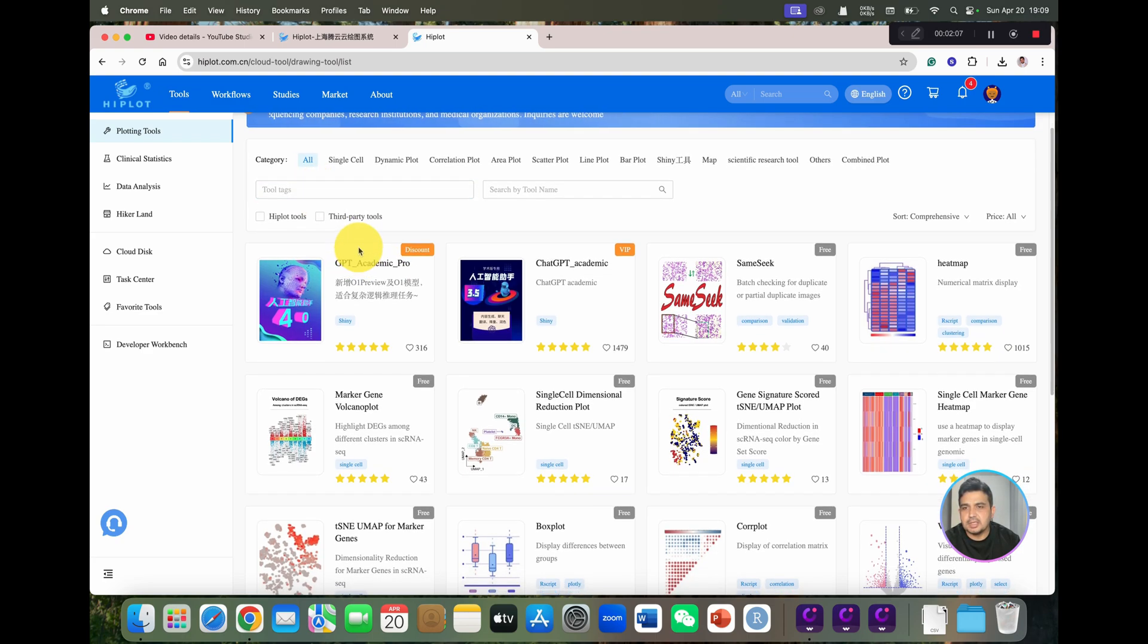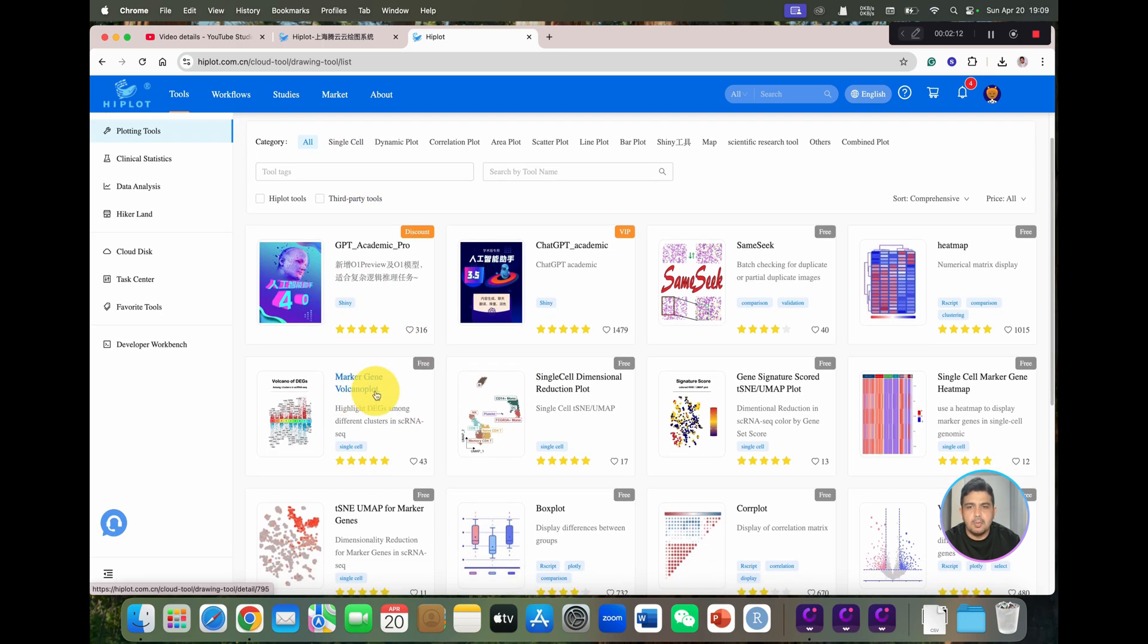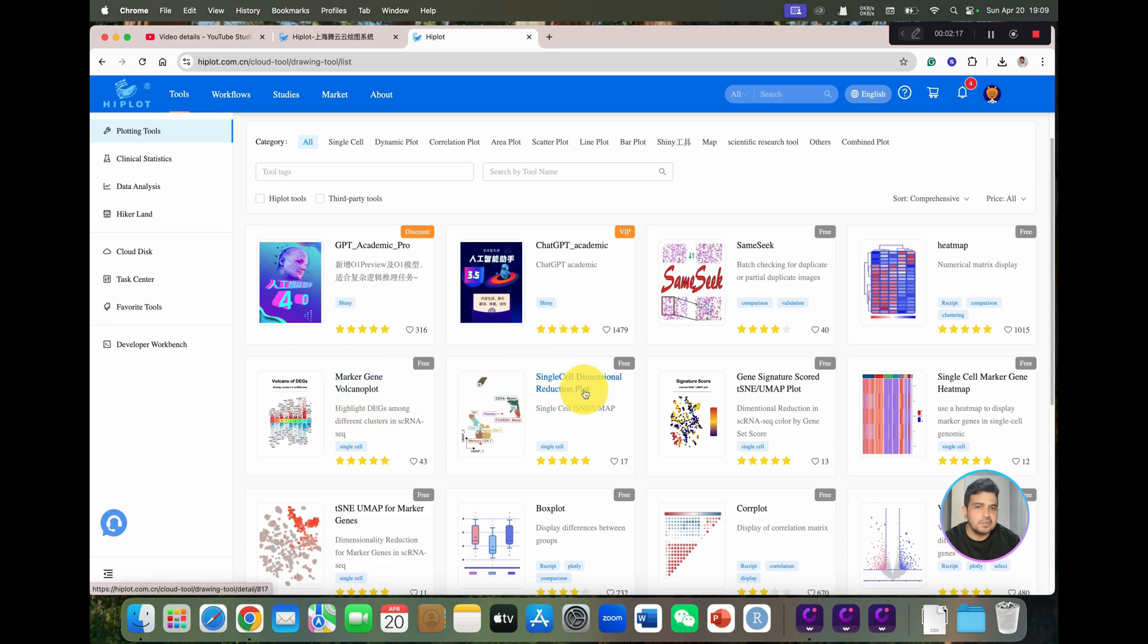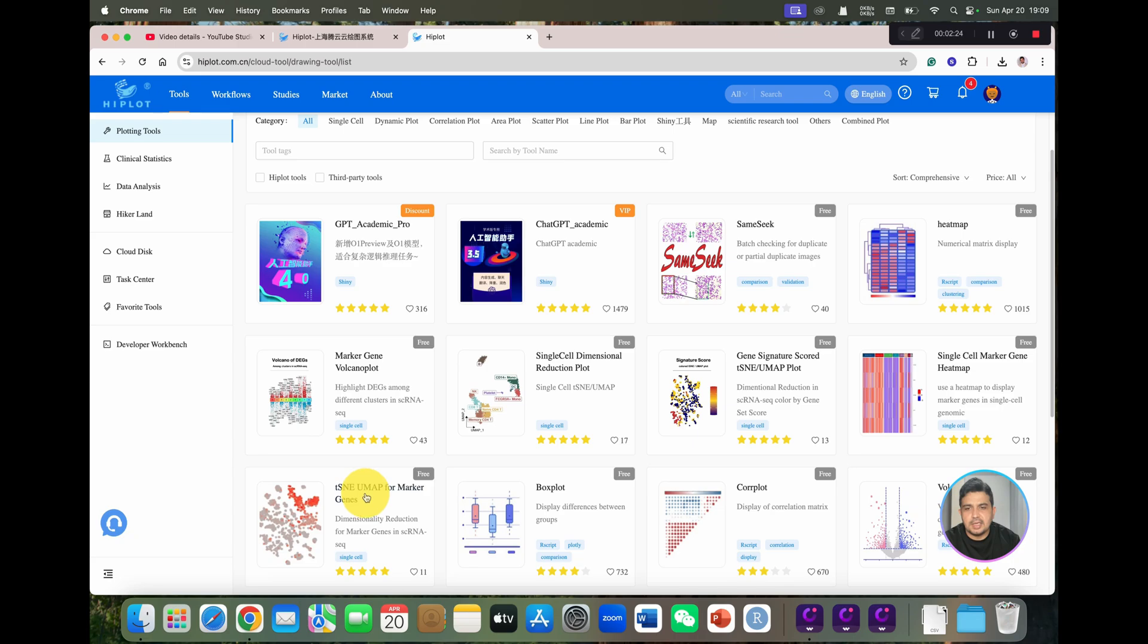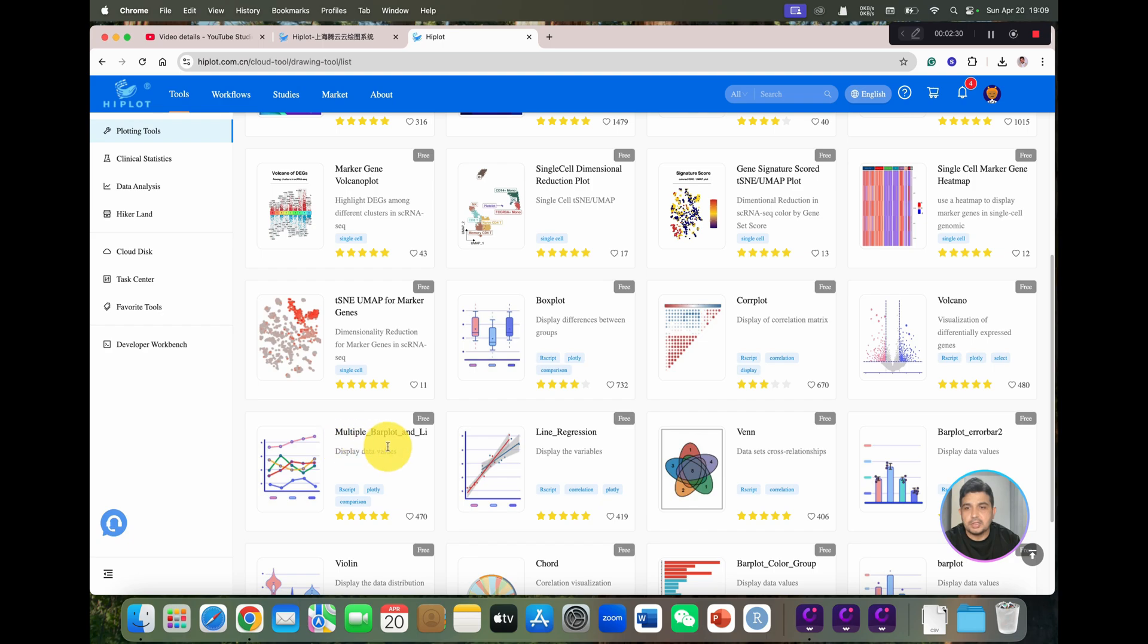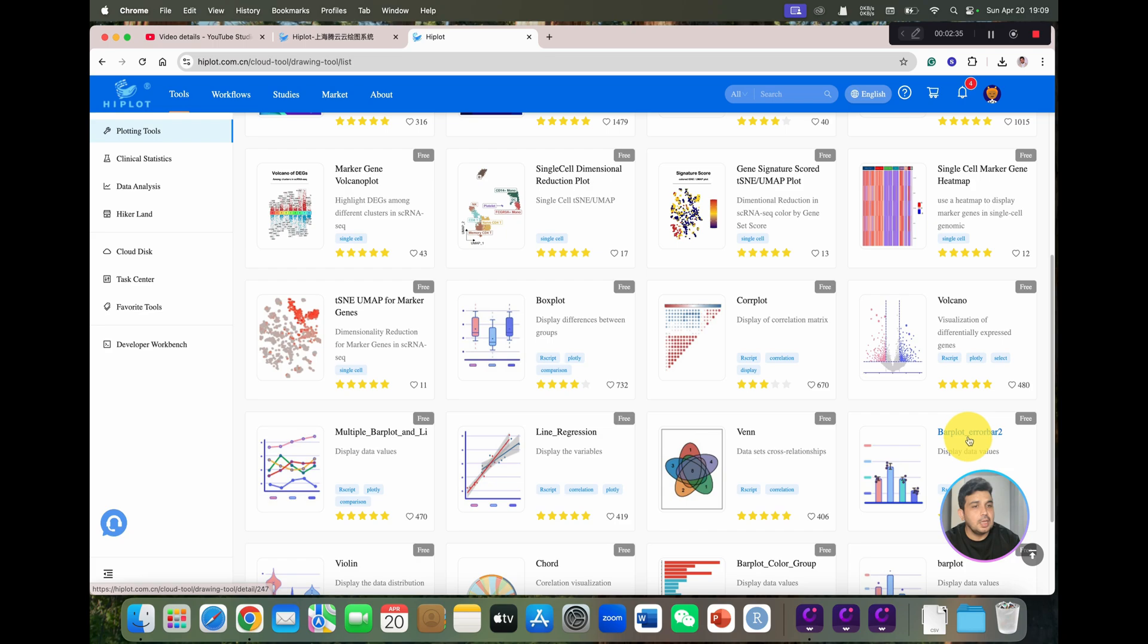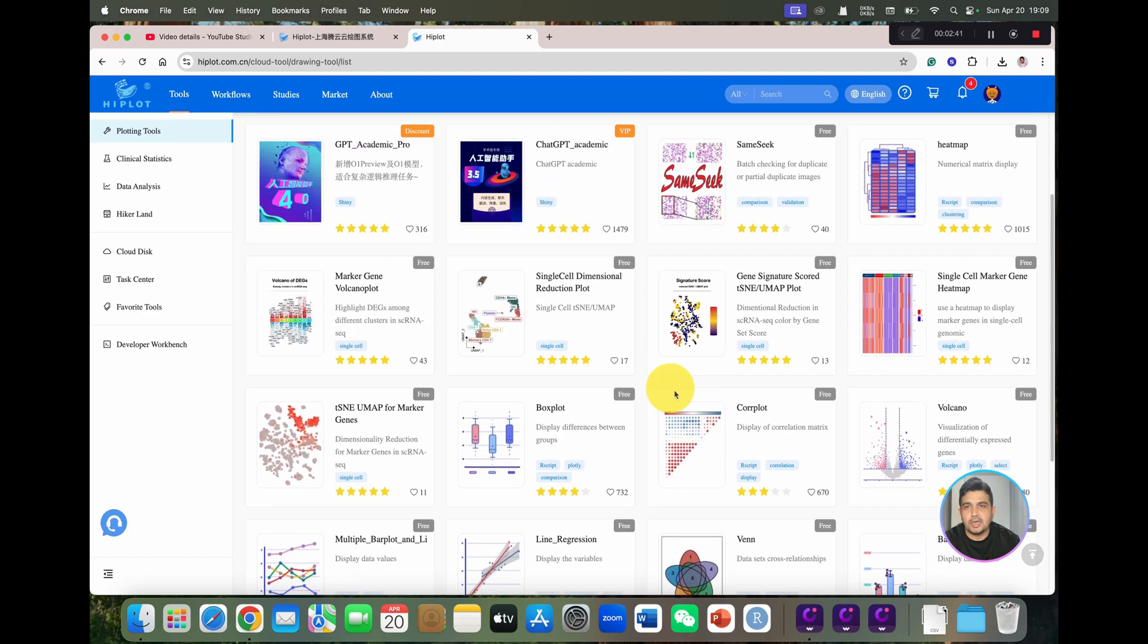If we can see on the first page, there are different options like marker gene, volcano plot, and you can see this is all free. Then we have single cell dimensional plot, new map plot, single marker, TSNU map, box plot, correlation plot, volcano plot, multiple bar plot, line regression, Venn, error bar plot, violin plot, chord diagram, and we have bar plot and bar plot 2.